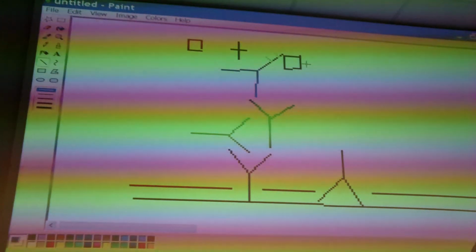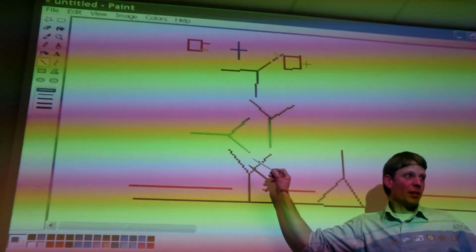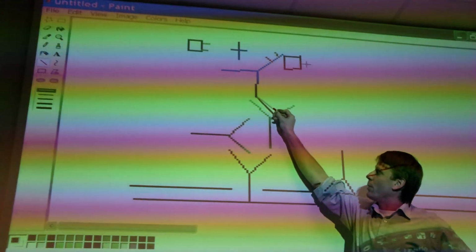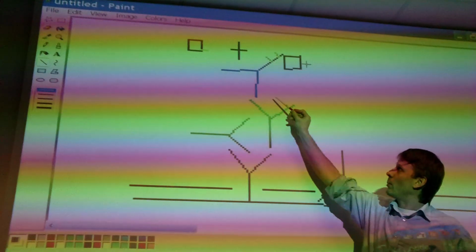One other trick is to generate antibodies, like you say, that are Fc specific. So this one should be Fc specific and this one too. So at least you avoid that this one binds to the Fab region, and you avoid that this one binds to the Fab region of that.